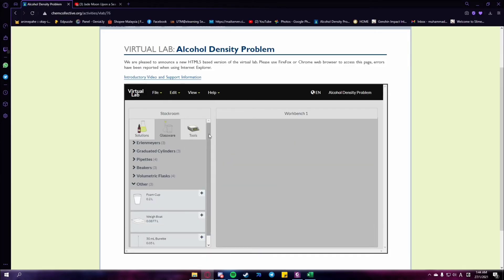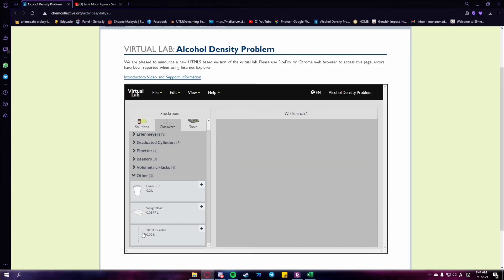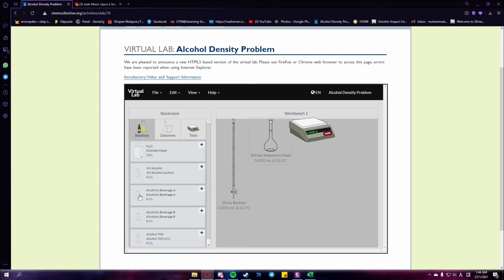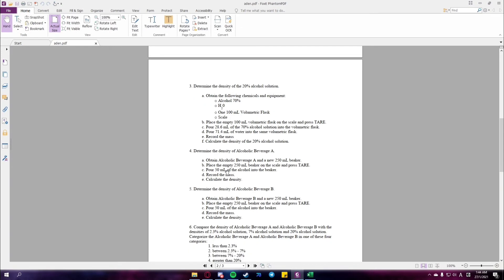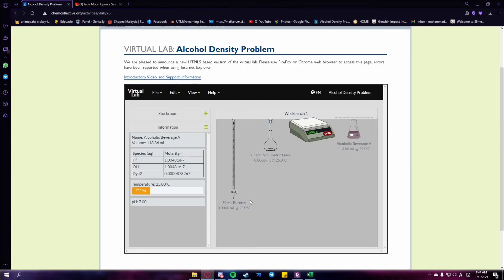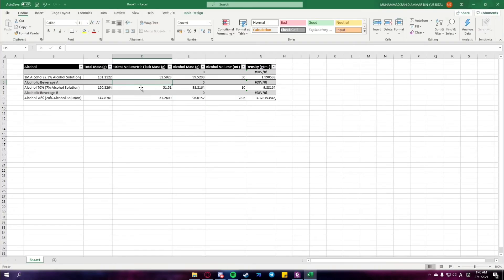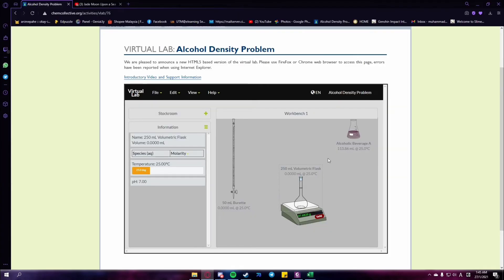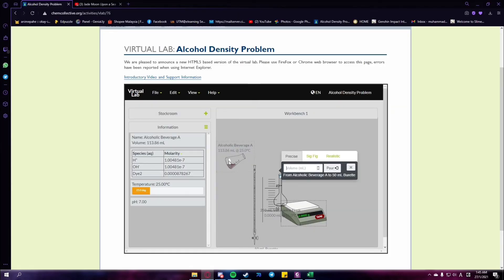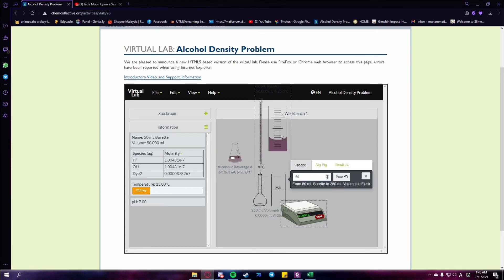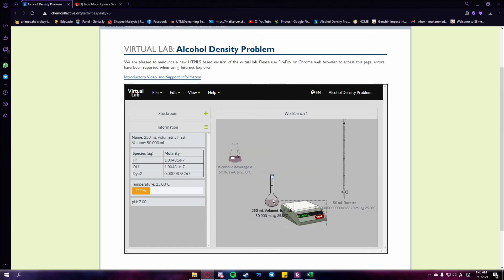Procedure 4 is a bit different compared to the other 3 procedures. In this procedure, we need alcoholic beverage A and a new 250 ml beaker. The first step is to record the mass of the empty 250 ml beaker. Then pour 50 ml of the alcohol into the beaker. After that, record the mass and calculate its density.